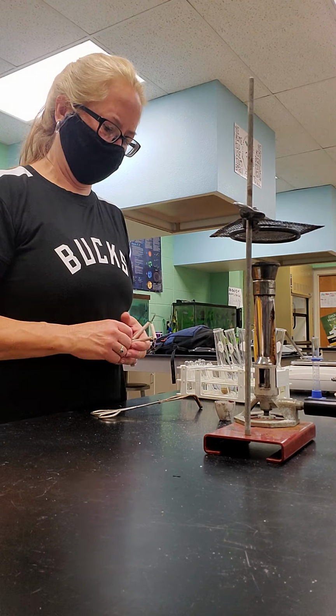Okay, here's what it looks like. It's black. So regular table sugar dissolves in water. Does this stuff? No. No, it doesn't. It discolors the water, but it doesn't dissolve. So the products of a chemical reaction have different properties than the original substance.